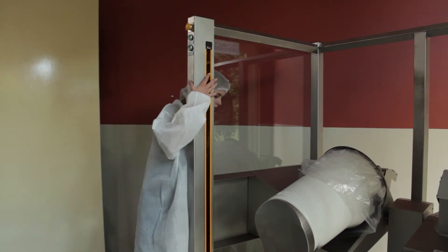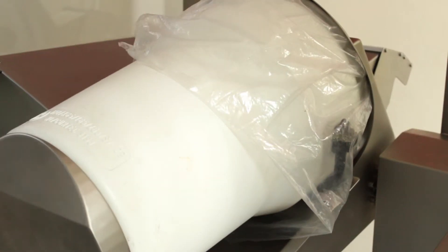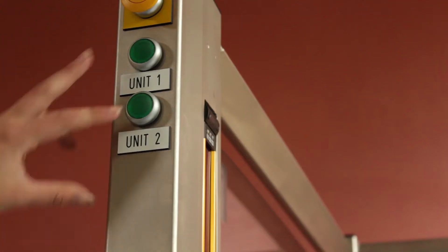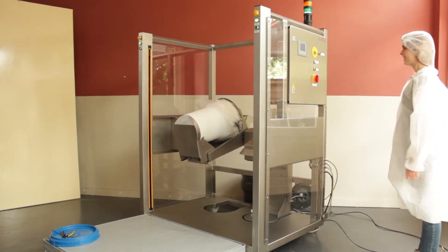A light curtain freezes every movement in the machine. The Technico Pharma drum tipper can be ordered with one or two tipping units.